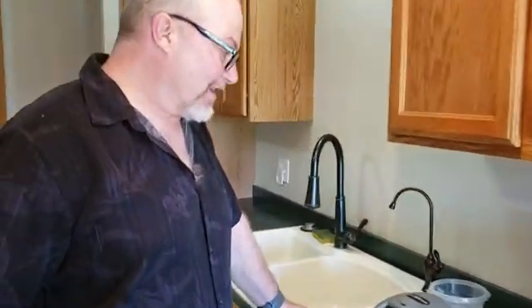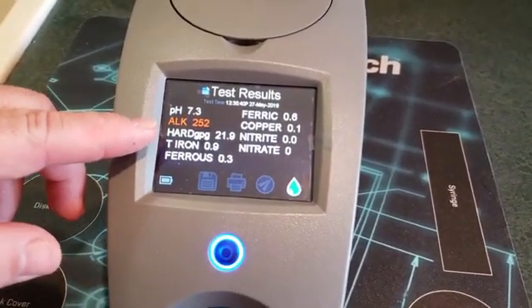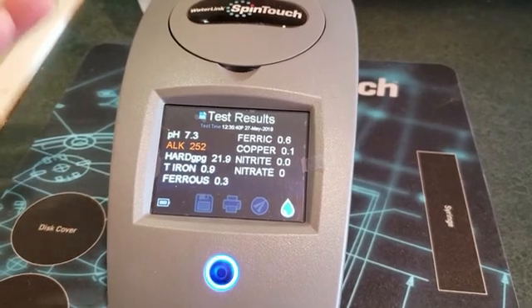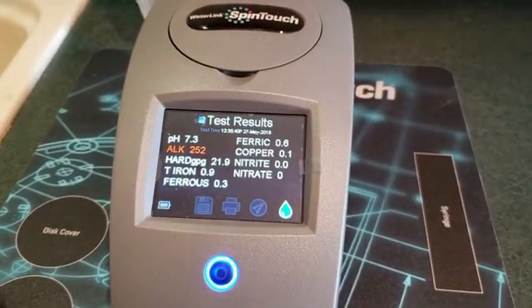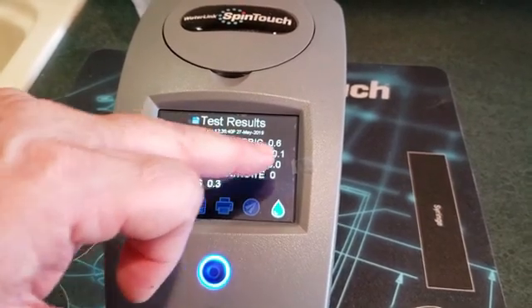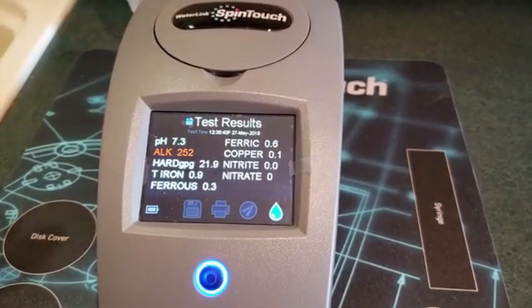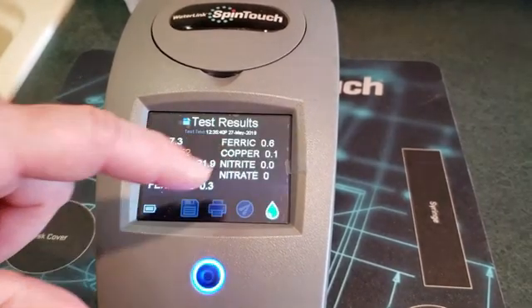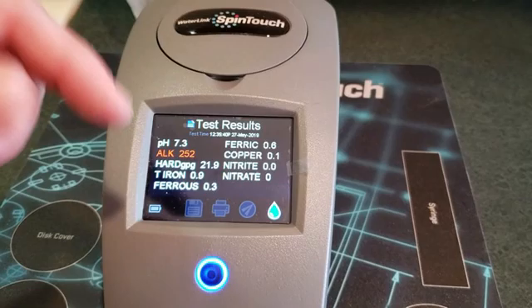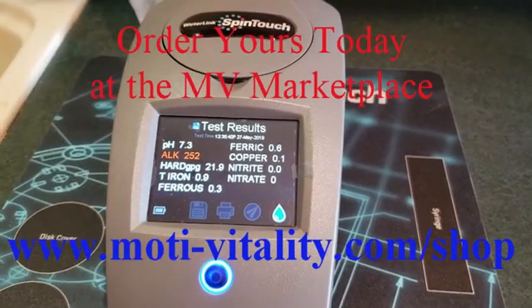We've got the results. pH is right at 7.3. Alkalinity is high — above 250. Hardness is right in line with where I said it's been, at 21.9 grains per gallon, almost 22. Iron is very close to one — that's consistent with visual testing. Ferrous is at 0.3 and ferric at 0.6, which is interesting but may be because I let the sample sit for a little while before testing. It would be best to let water run directly from the well for an accurate ferric reading. Nitrates and nitrites are both at zero, and copper is at 0.1.